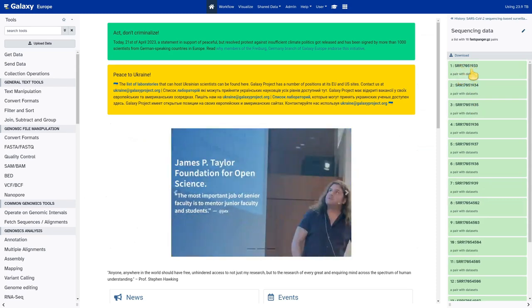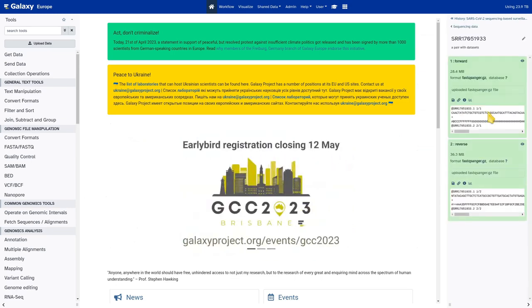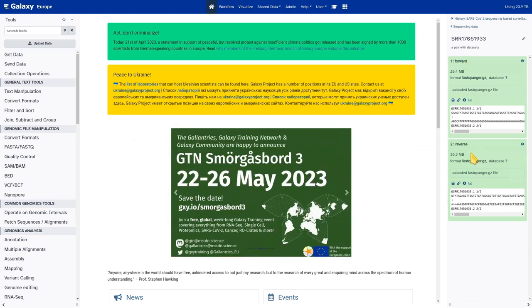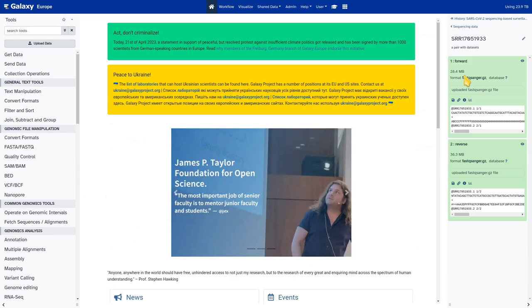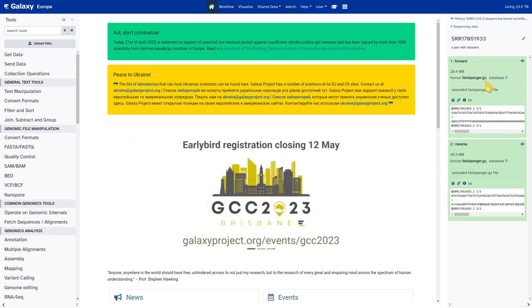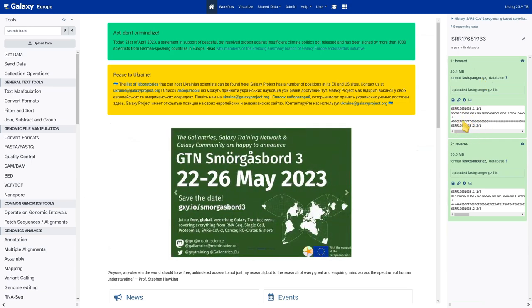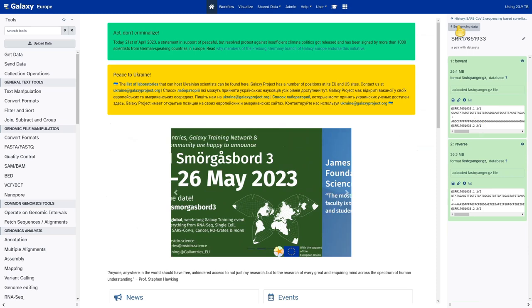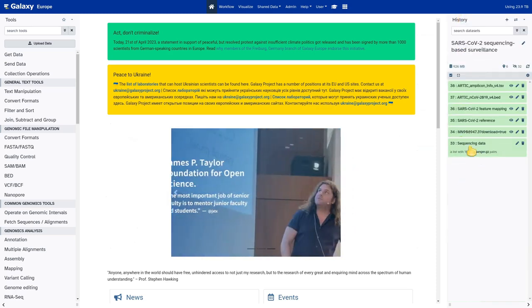Each of these elements is a pair of datasets. If I click on one of them, I can see there's a forward and reverse dataset contained inside. Each of these datasets is in the format FASTQ GZ — GZIP compressed FASTQ — which Galaxy still allows you to preview here as plain text. Going back out of this list of pairs, we've confirmed this input is what it should be.